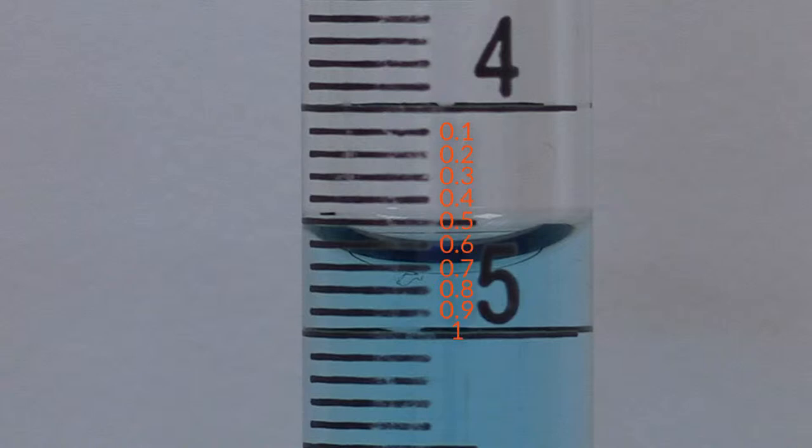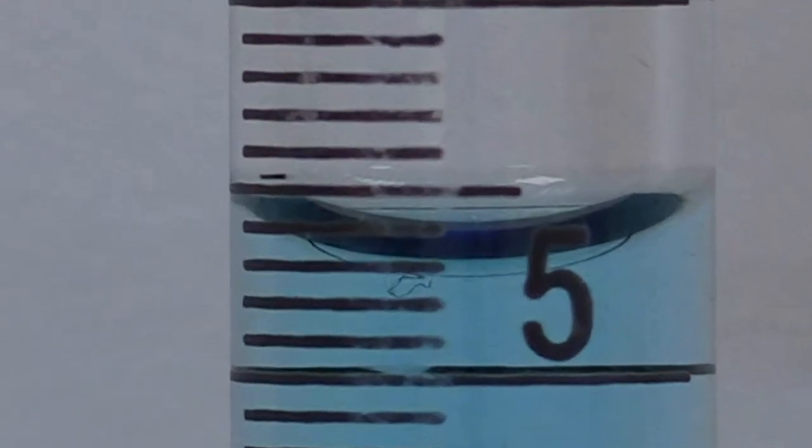Like all glassware, we're going to read this at eye level. Like our graduated cylinder, we're going to zoom in with our mind's eye and further divide the space between two graduations into ten parts. For this burette, each graduation is 0.1. We divide each of those 0.1 graduations into ten parts, making each of those ten parts 0.01. This means that our burette can be read to the hundredths place.